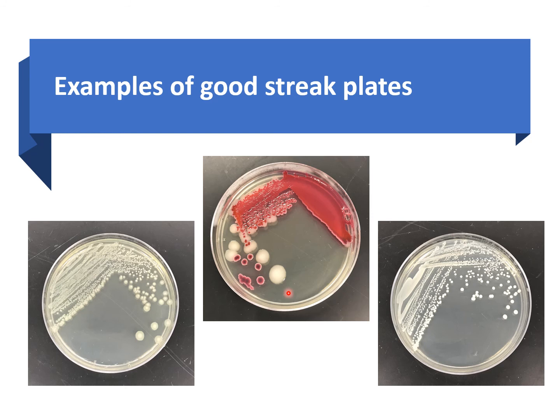And then, as I said, you can achieve a pure culture. How do you achieve a pure culture from this plate? Well, pick up one of your colonies. So if I want to have a pure culture only of that white colony, then I'm going to grab an inoculating loop and pick up a sample only from this colony.